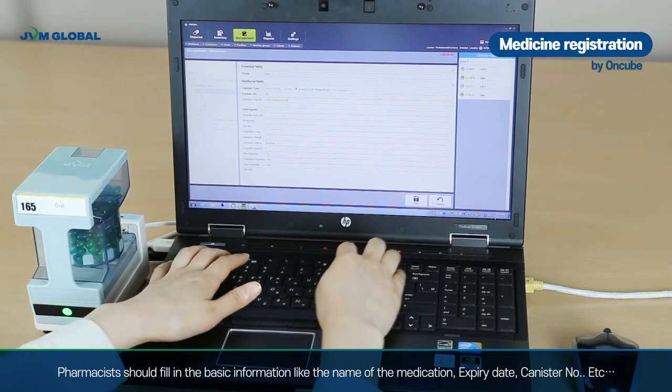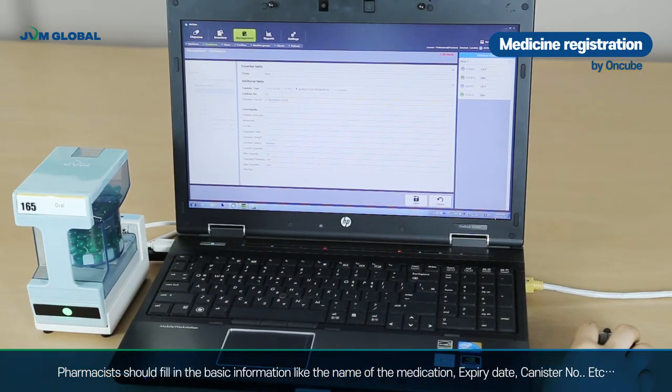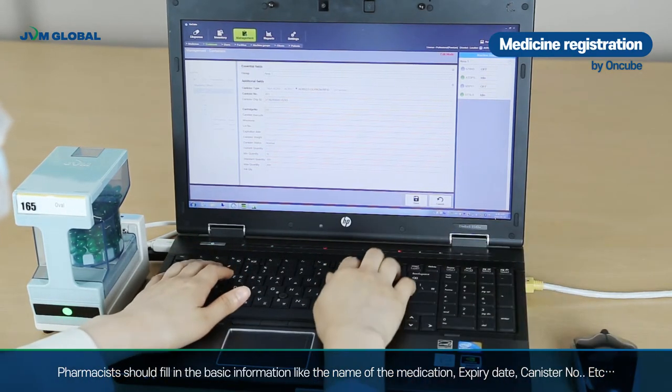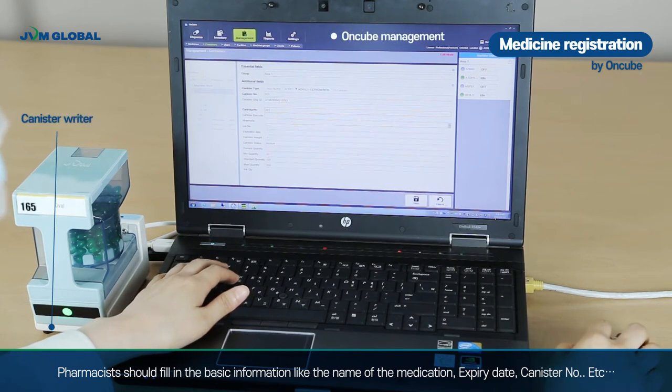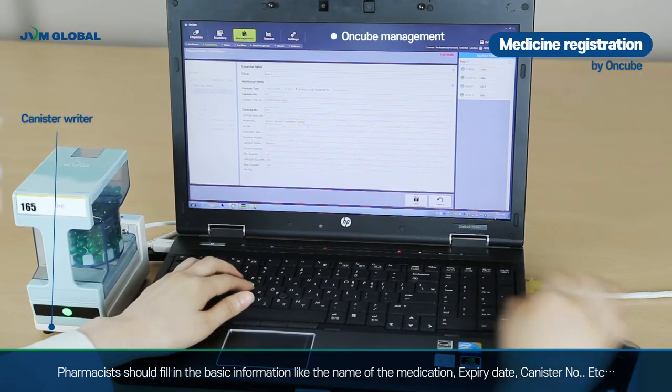Pharmacists should fill in the basic information such as the name of the medications, the expiry date, and the canister number.